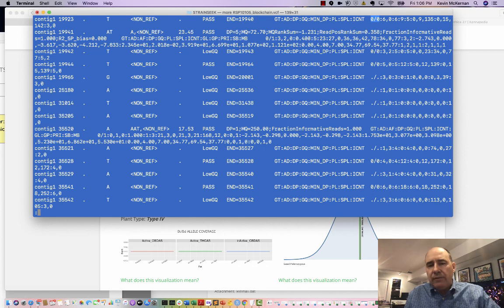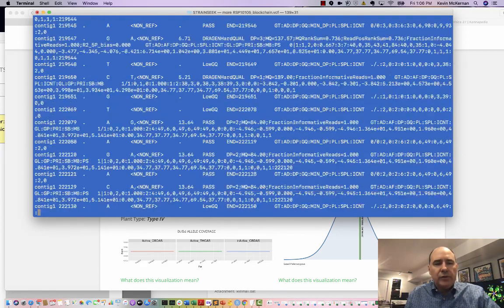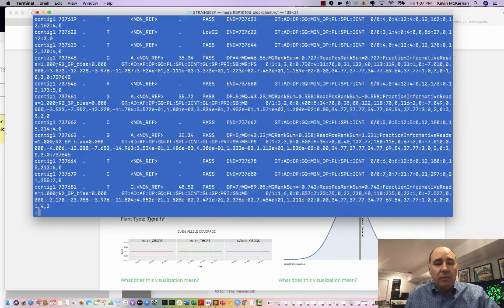In here are different bits of information in terms of how many reads are covering it and quality scores and whatnot. You can look about what all these little details mean if you just look up VCF files on the internet. It will explain to you the file format and all the other information that's encoded in these comma-separated forms over here. But this is really the critical key because this has your genotype right there. That's the thing you want to look for. This is the coordinate and where. So inside this file, you're going to see lots of different insertions and deletions and genotypes. And it's a very big file because we are covering 3.2 million bases.